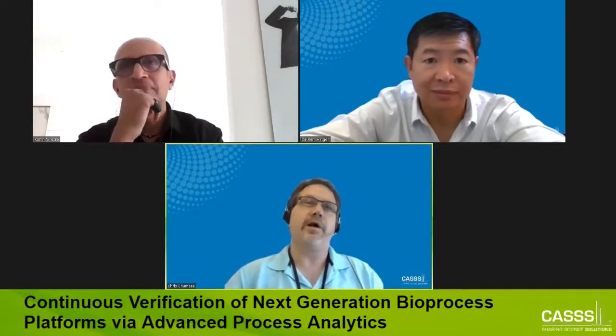Great, thank you. So I had another question, Rohin. At the very first conference, I know it was first mentioned whether or not mass spectrometry had a place in the quality control laboratories on the subject of testing. Again, in 2013, on the 10-year anniversary, there was an entire session dedicated to the possibility of moving mass spectrometry into the quality control laboratories. Here we are 8 years later, and I wondered what your thoughts are on the prospect of mass spectrometry as routine analysis in the quality control laboratories. I do believe that it certainly has been implemented at some companies. Wanted to get your thoughts on that.